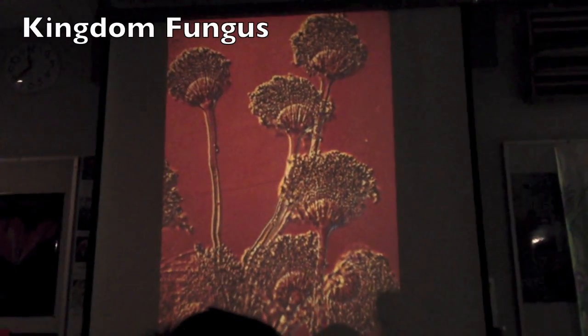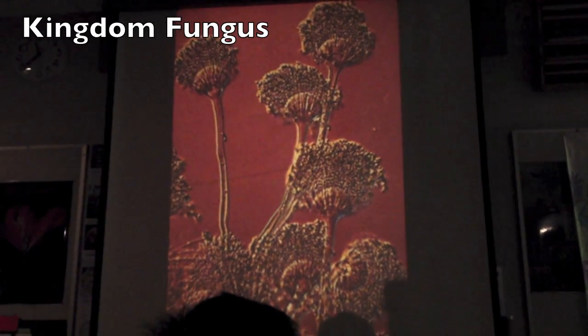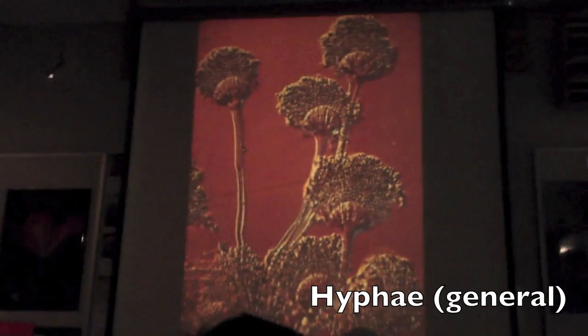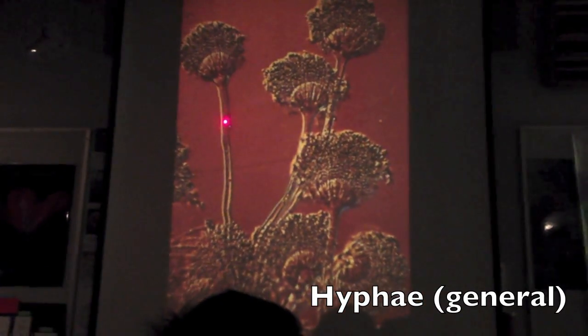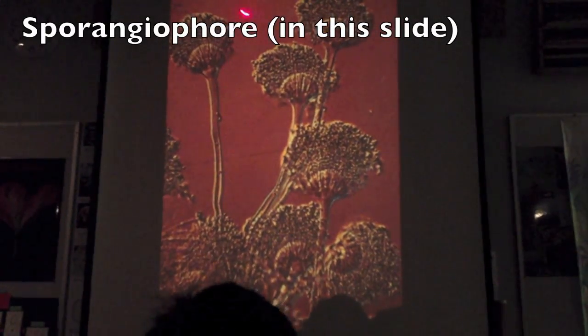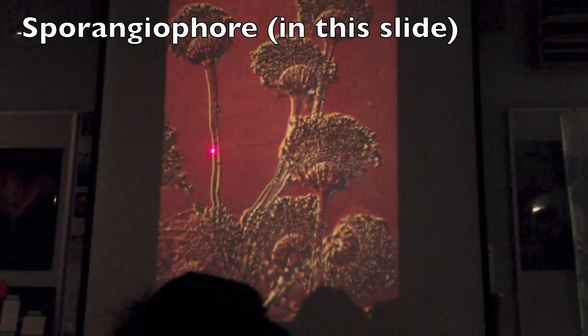What kingdom? Fungus, right? What's this filament called, in general? Hypha. And then in specific, you would call it what, because it's got this on the top? Sporangiophore.